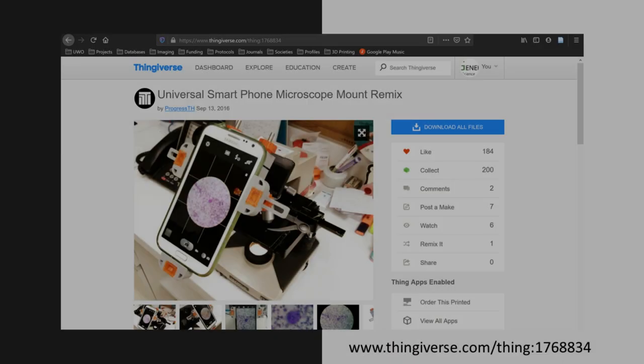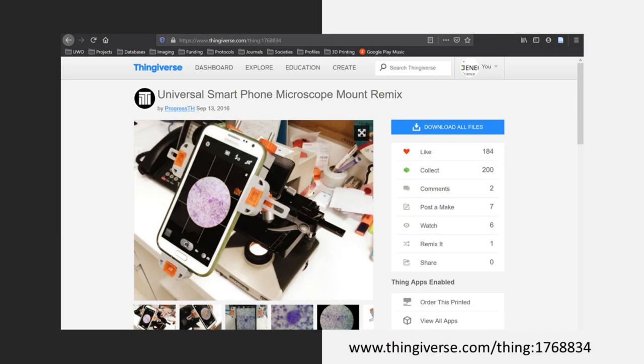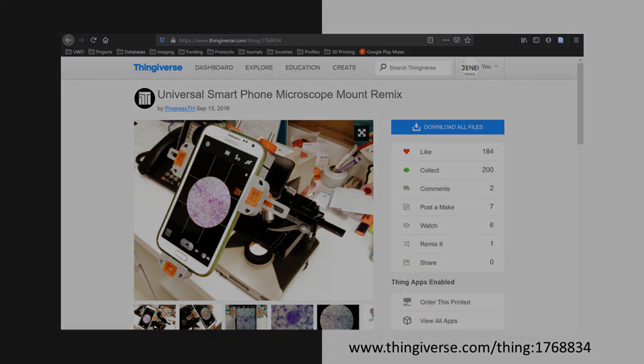Luckily there's a variety of free plans for cheap 3D printed mounts that allow you to easily attach a cell phone to the ocular of your microscope. I use the model shown here extensively, in fact I've made dozens of these because I use them in a course that I teach, and I've included a link to plans for this particular mount in the video description.